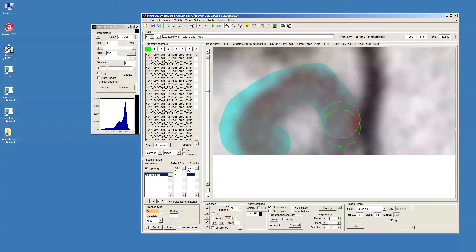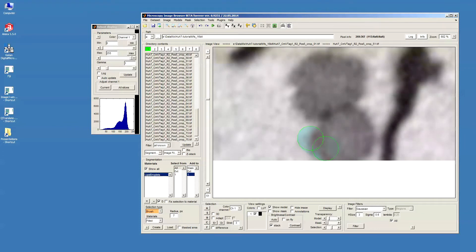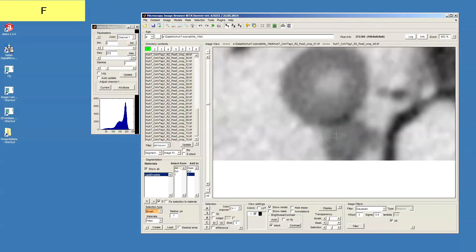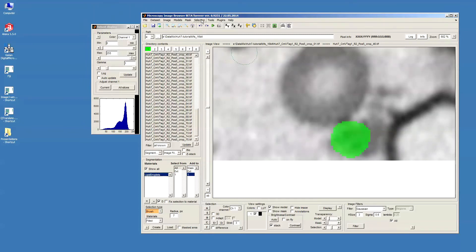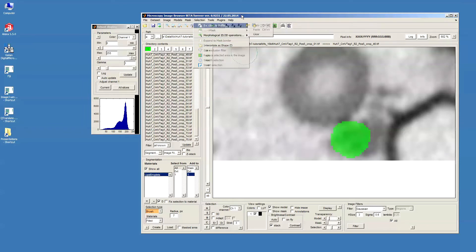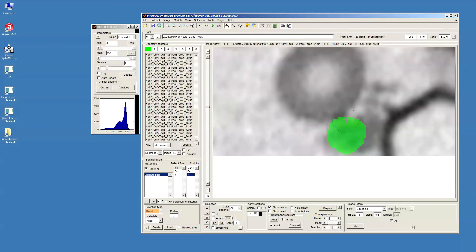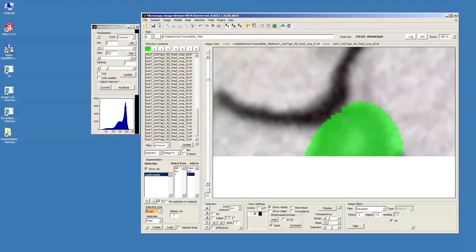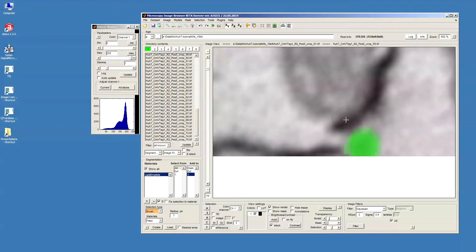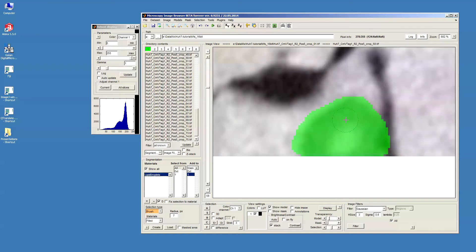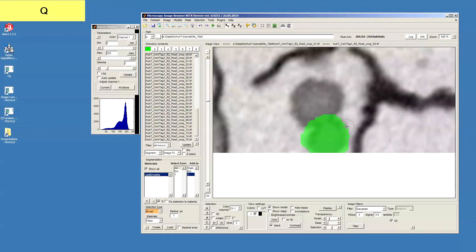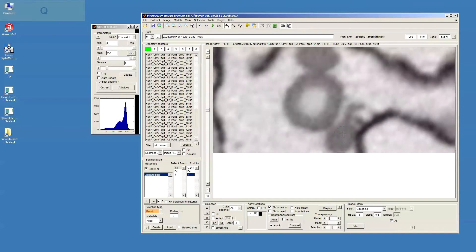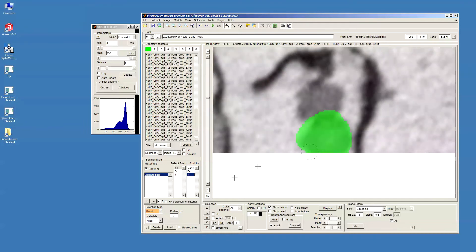So basically what I do is I just draw rough outlines around the lipid droplet using the brush. Then I go to menu selection interpolate or I can use I shortcut. What happens is we interpolate between the empty slices that we have. Now we have the lipid droplets kind of roughly segmented.